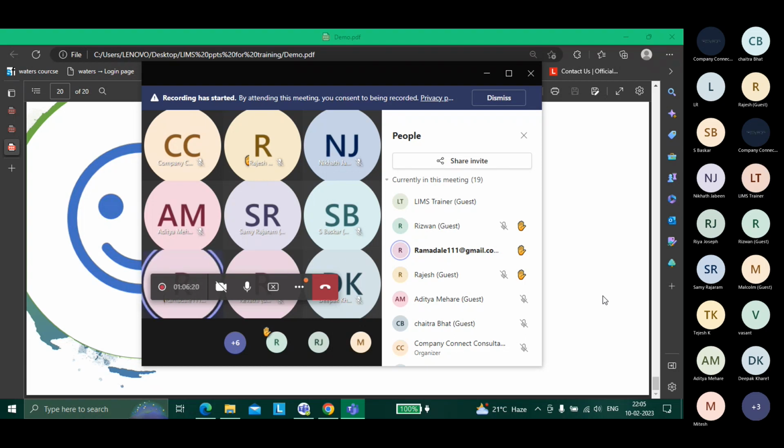Okay, but I'm not looking for the development of the LIMS, but for the testing of LIMS, like LIMS software testing and each module. If you want to come to testing in IT, there should be something which separates IT from pharma, right? Something which is software. Some table structures you need to explain confidently, right? Something at the back end which will help your interviewer understand that you know how things are working at the back end. You don't only know why I'm clicking, you know what happens when I'm clicking, and why this is happening.